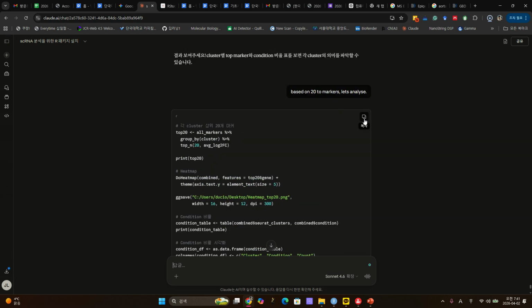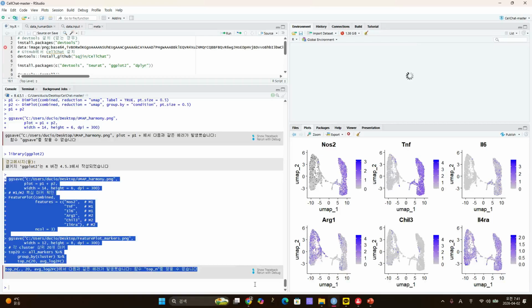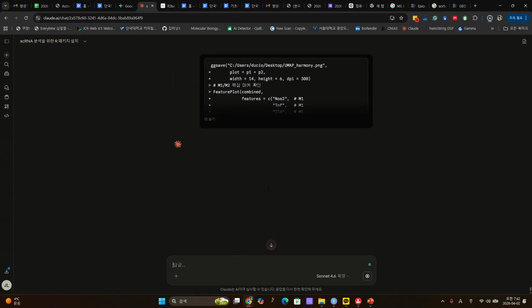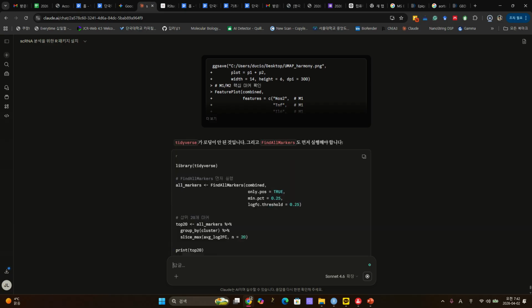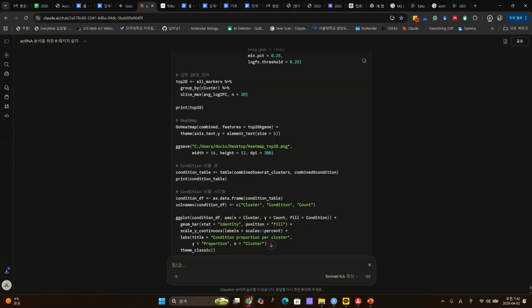Okay, copy, paste. Some error. Okay, error here. So they are correct with their code.